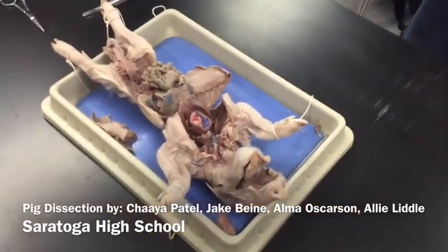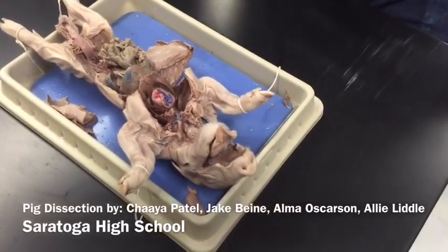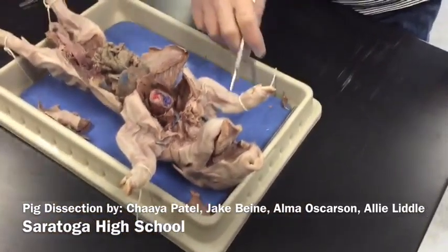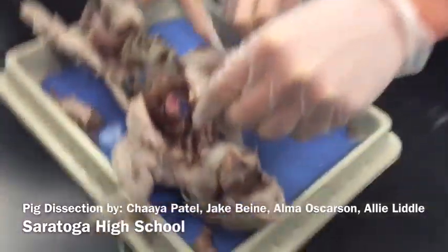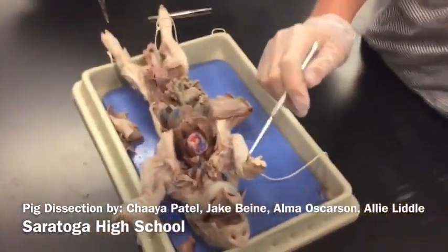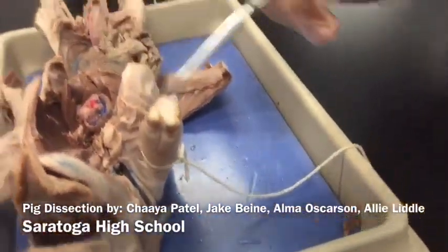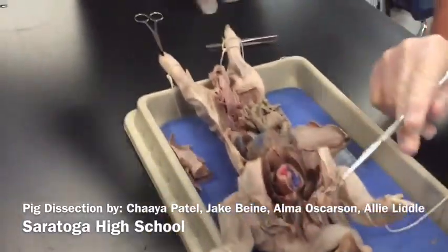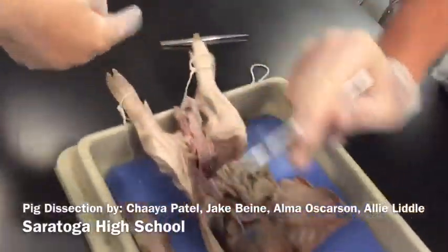Okay, so point where the wrist is. The wrist is there on the pig. The shoulder is like up underneath here. And the digits are on the toes. The thoracic cavity is the top of the pig, and the abdominal is the bottom.